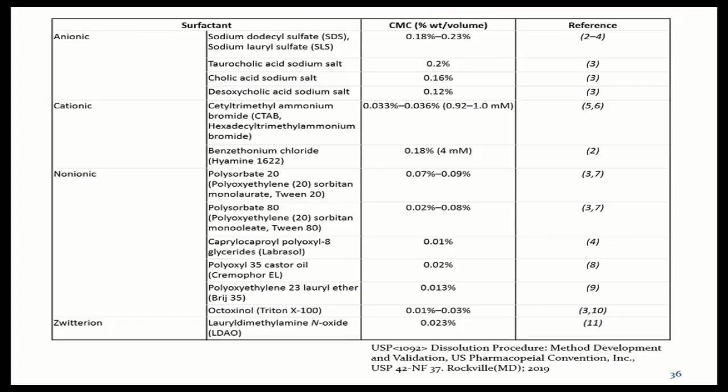I would guess that your selection of pH or pHs should depend on what the active form or forms of the API is or are. Excellent. This is why we have experts from around the world come in here and help us through these topics. And again, this is a discussion. That's valuable input, and that's what we're looking for on the discussion group. Thanks very much.